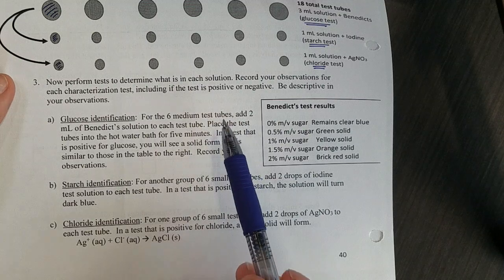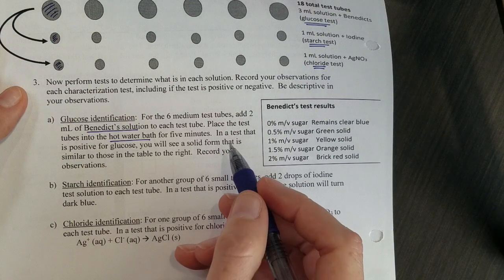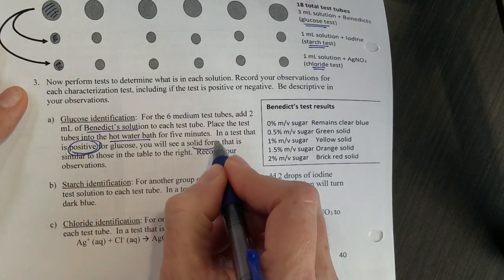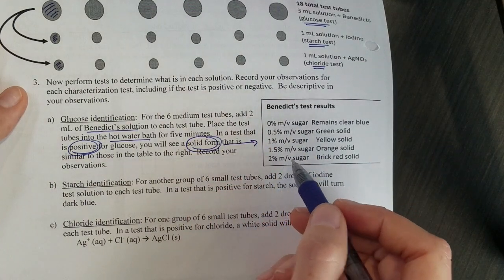Glucose identification: we're going to add Benedict solution and heat them. If it's positive we will see a solid form and here are the colors that you will see. They tell you the percentage of sugar.